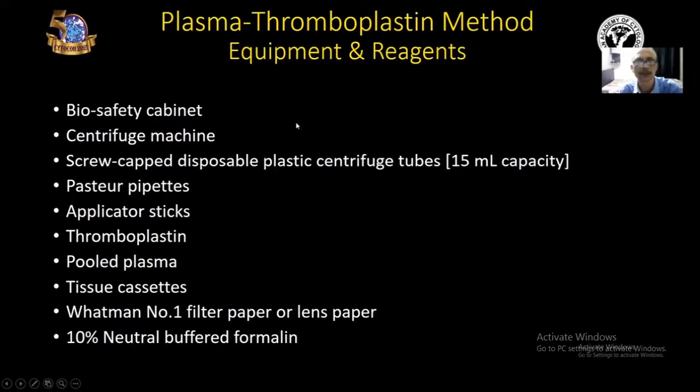The equipment and reagents required for this procedure include biosafety cabinet, centrifuge machine, screw-capped and disposable plastic centrifuge tubes of 15 ml capacity, Pasteur pipettes, and applicator sticks.